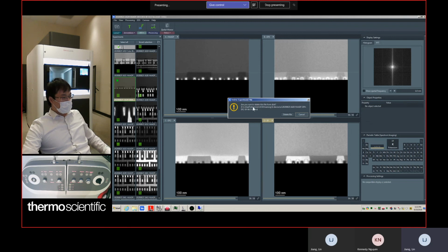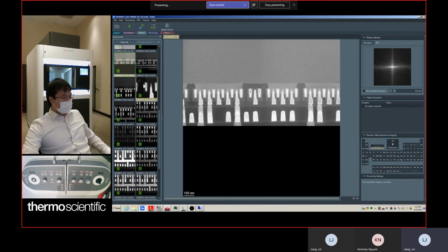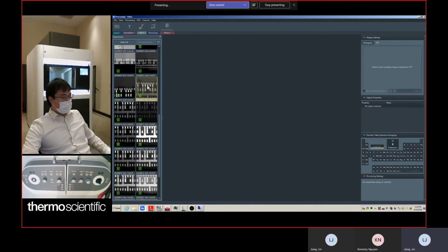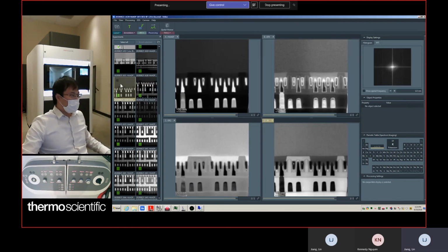It will say, are you sure you want to delete this file? Yes, delete it. And if you don't want to see an image in this view anymore, for example this image, you just right click and say close. Or you can open this view in a new window. Close will close the view but keep the file. For this one, I can just select it and say delete, and it deletes the file.